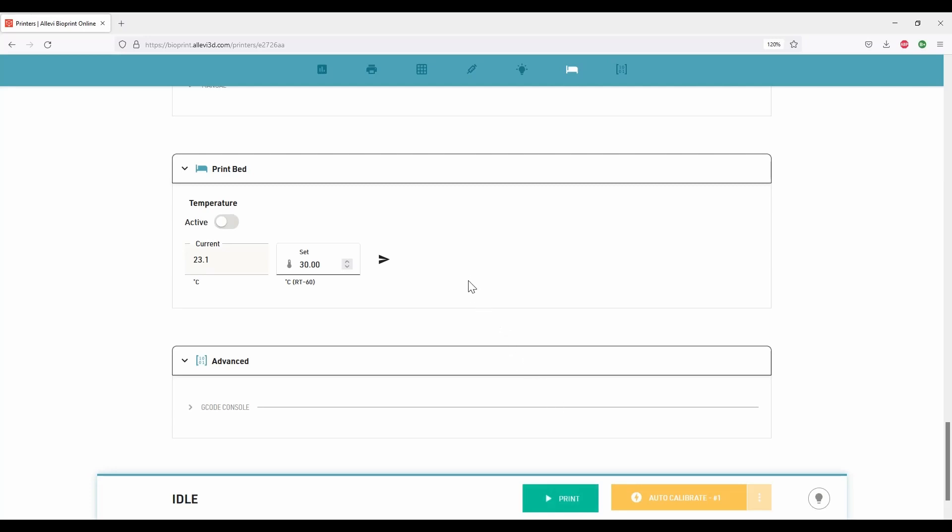After optimizing and updating all the parameters, click on the print to start the printing process.